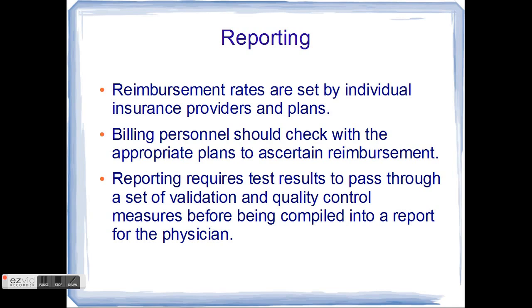Reporting requires test results to pass through a set of validation and quality control measures before being compiled into a report for the physician. This is an important point because results aren't any good if they're not accurate. So there is a process within these electronic systems for that.